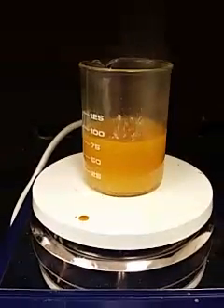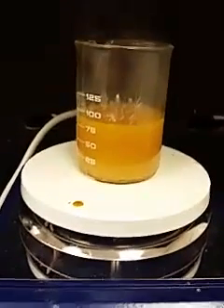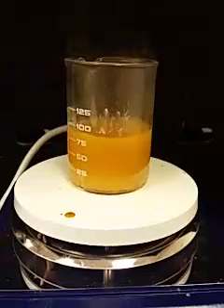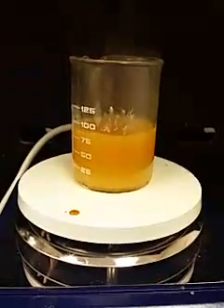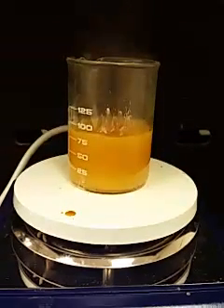We're attempting to carry out a reaction between drying oil linseed oil and glycerol. We're going up to 200 to 220 degrees, catalyzed by tin oxalate. We are attempting to make a non-ionic surfactant which is a drying agent.